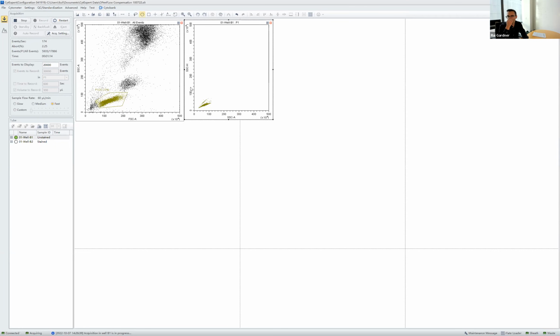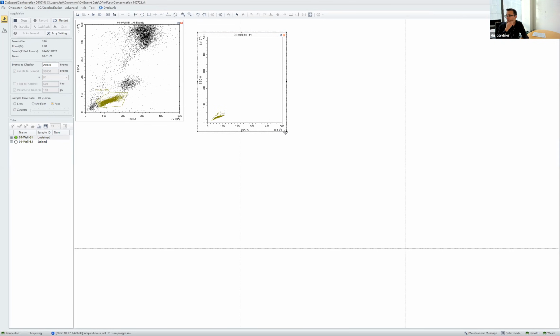Okay, Kathy, while you're doing that, Kara was asking about one value in the comp matrix being yellow. I didn't see it because I was answering another question here.